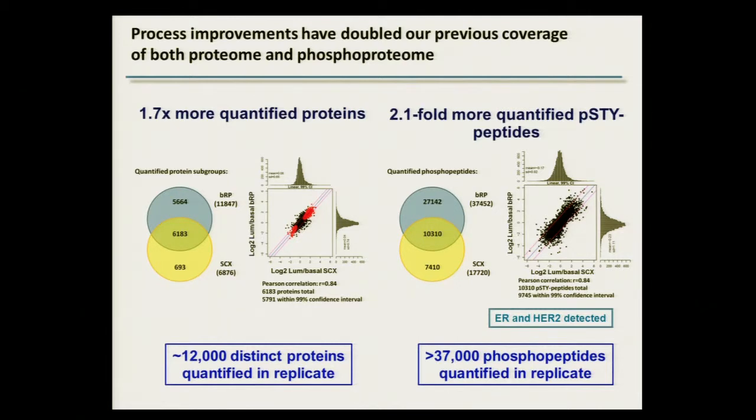Right. So the question is, how do sample handling steps affect the variability in your analysis, especially in your quantitative analysis? And of course, if you do in parallel, for example, separation techniques where you fractionate your peptide sample into multiple fractions, or if you do in parallel your tryptic digest, it can happen that in one reaction, trypsin cleaves at a certain point and at a certain part of the protein, and in the other reaction, a missed cleavage occurs, for example, so that you get a different peptide form, and this adds variability to your analysis.